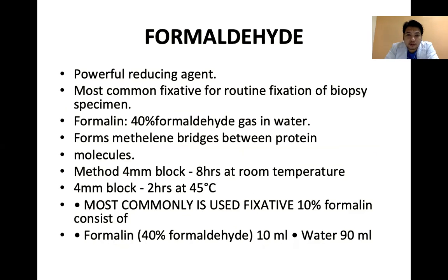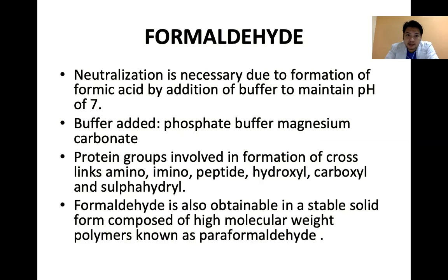We're discussing more on formaldehyde since it is the most common fixative. It is a powerful reducing agent, the most common fixative for routine fixation of biopsy specimens. In formalin, 40% formaldehyde gas in water forms methylene bridges between the protein molecules. Use 4 millimeter blocks, 8 hours at room temperature. The most commonly used fixative is 10% formalin, consisting of 10 ml of the 40% formaldehyde plus 90 ml of water.